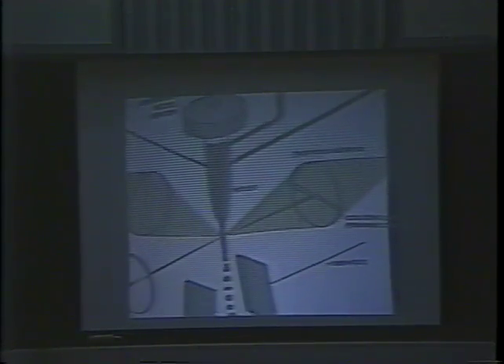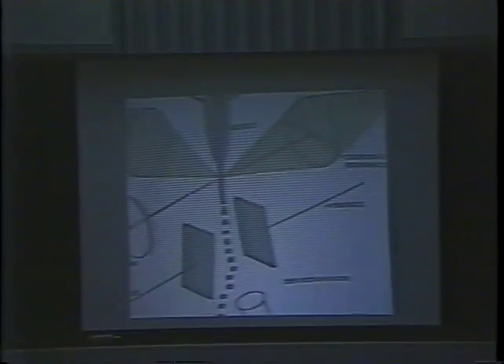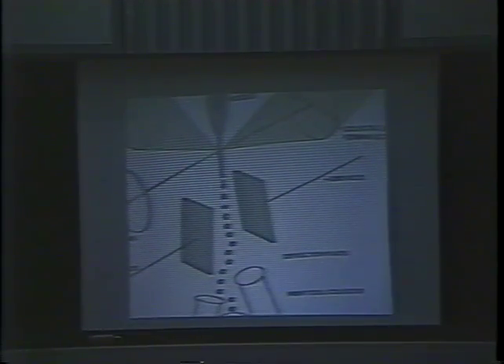After desired cells pass through the laser beam, they are electrically charged, positive or negative, and continue to fall by gravity until they reach electrical deflecting plates. The cells are then deflected to the left or right based on their charge and fall into collecting tubes. Droplets lacking cells, or containing unwanted ones, continue to fall straight into a collecting vessel.